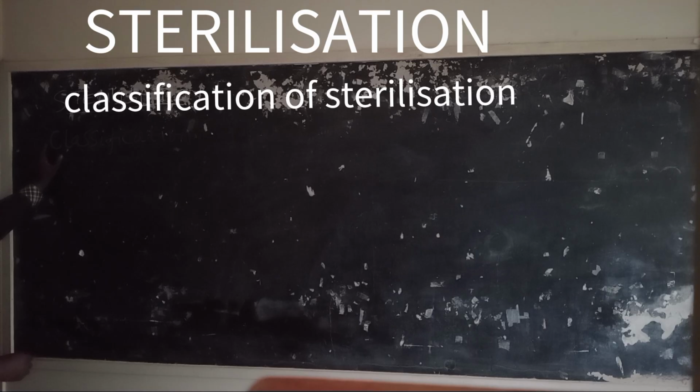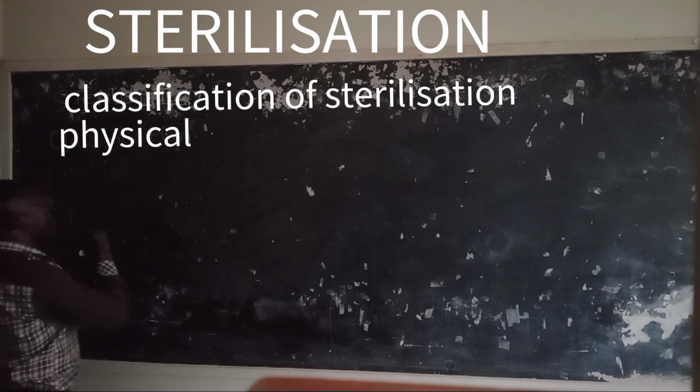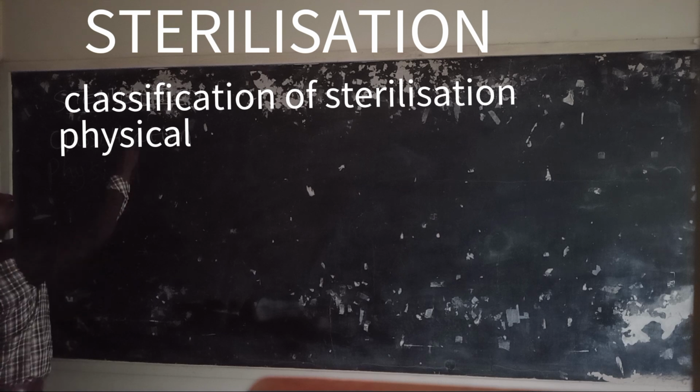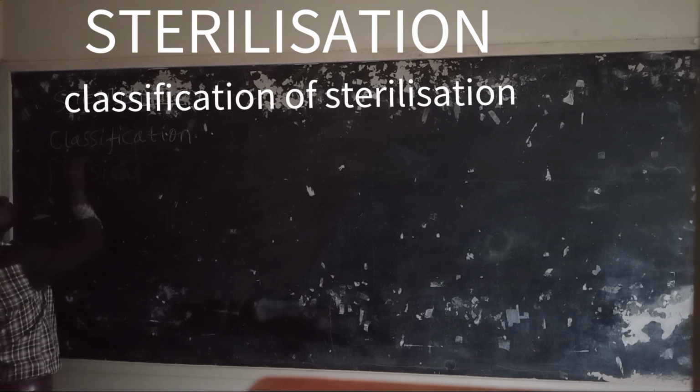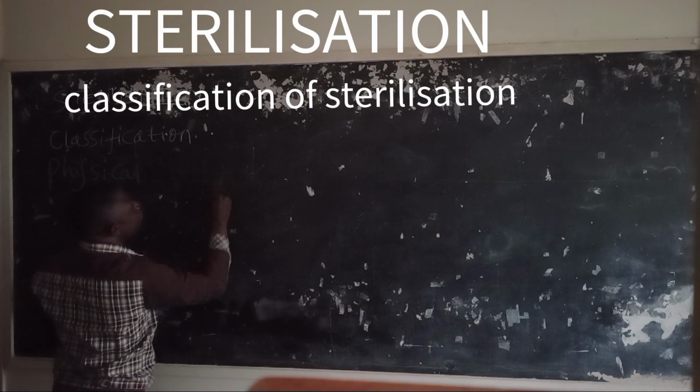On classification of sterilization, we classify them into physical and chemical.